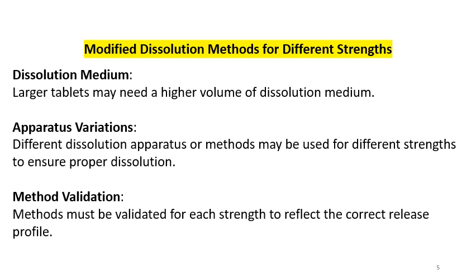Here understand that if you are performing dissolution of the 100 mg strength and the 10 mg strength in 900 ml of media, and you want to match the dissolution of 10 mg to 100 mg, then you will need more amount of media or a higher stirring rate, otherwise it will not match. Sometimes sink condition differences will be there because of the drug load in the different strengths.